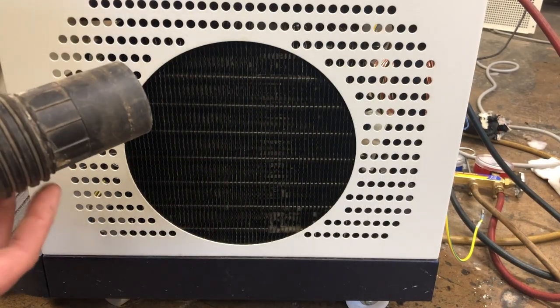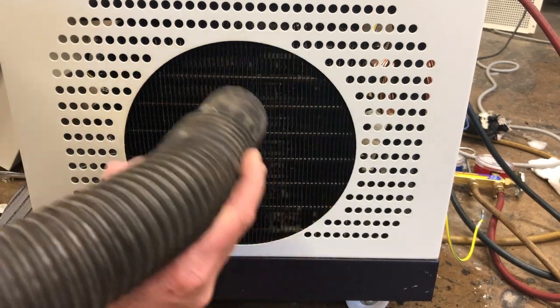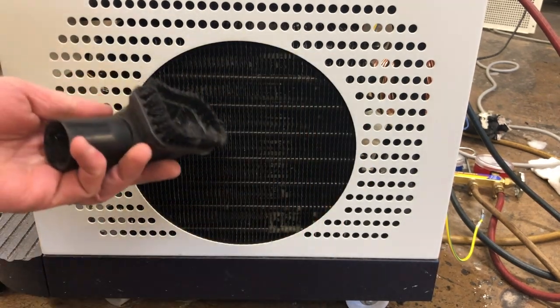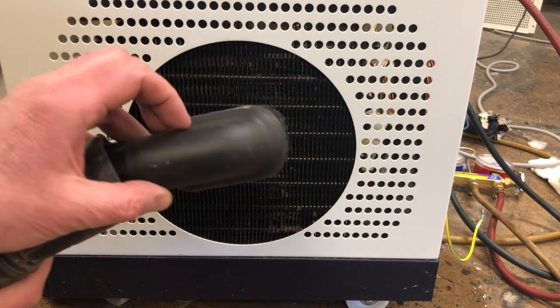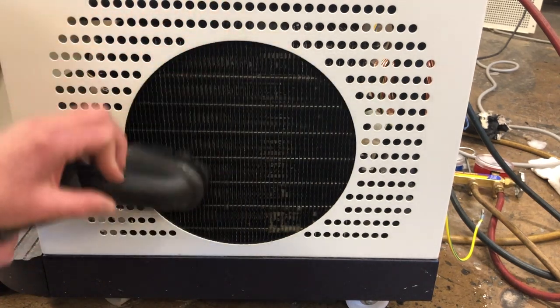A vacuum cleaner is another really good option for cleaning the coils. You would just suck the dust out, and if you have one of these brush attachments you can put that on to help get some of the dust out as well.